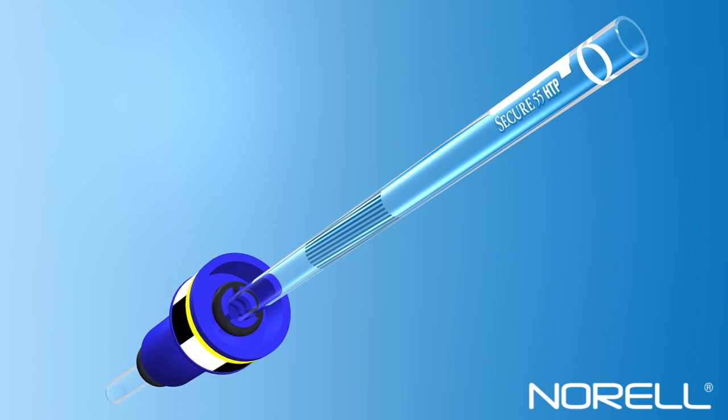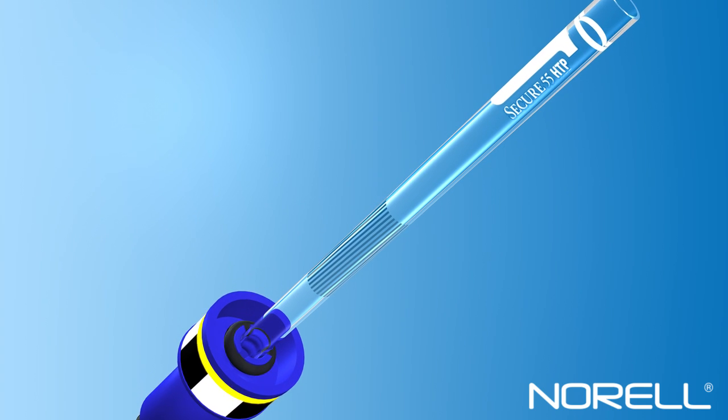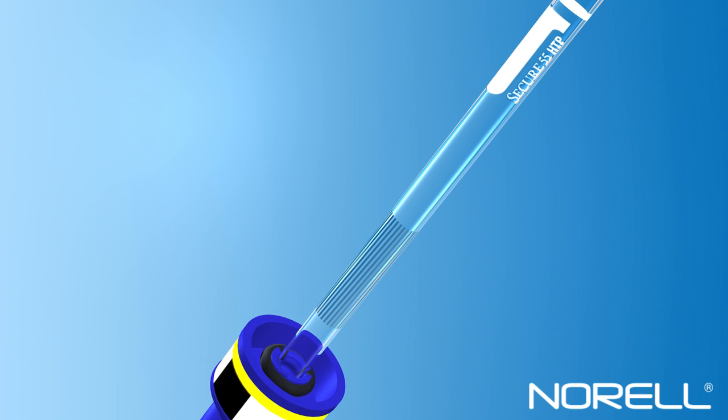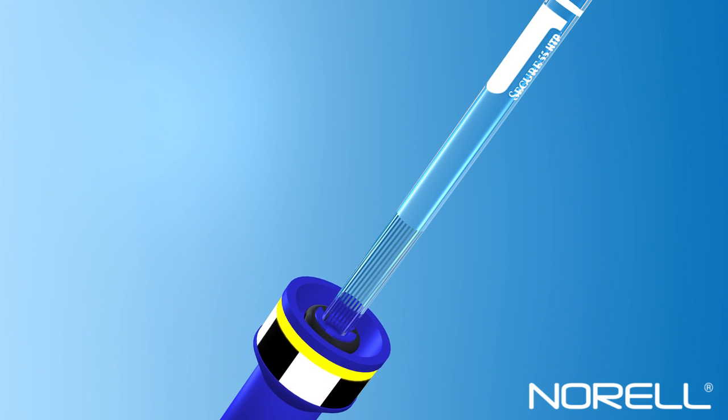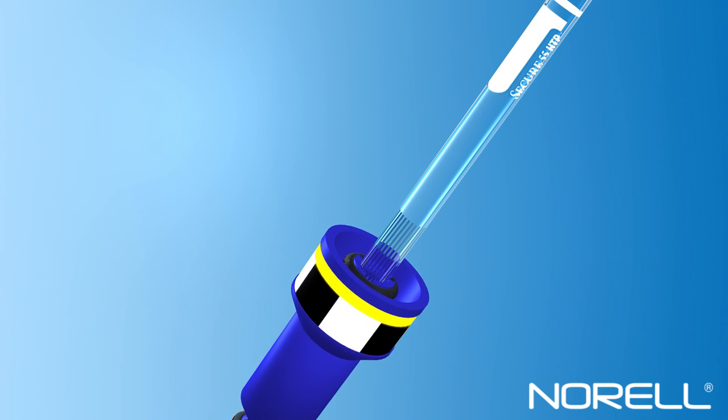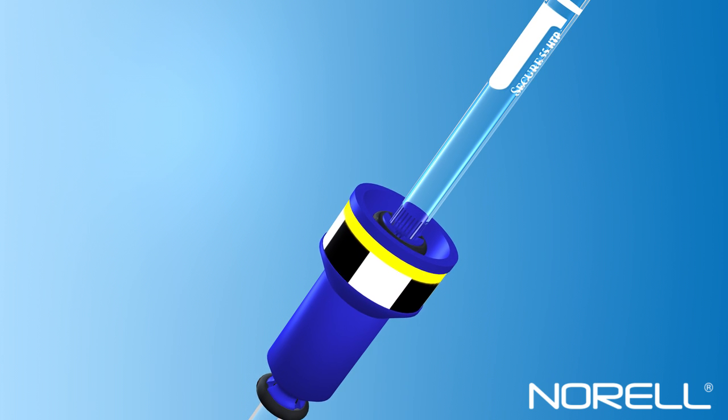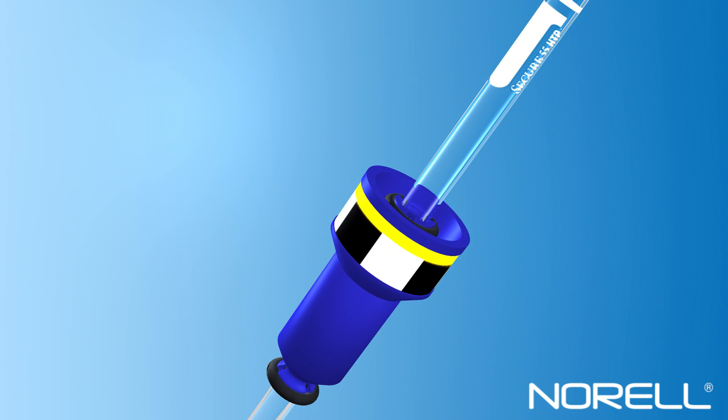When inserted to the maximum extent permitted by the depth gauge, the textured surface treatment on the NMR tube will coincide with the upper O-ring of the turbine, providing a non-slip surface at the point of contact.